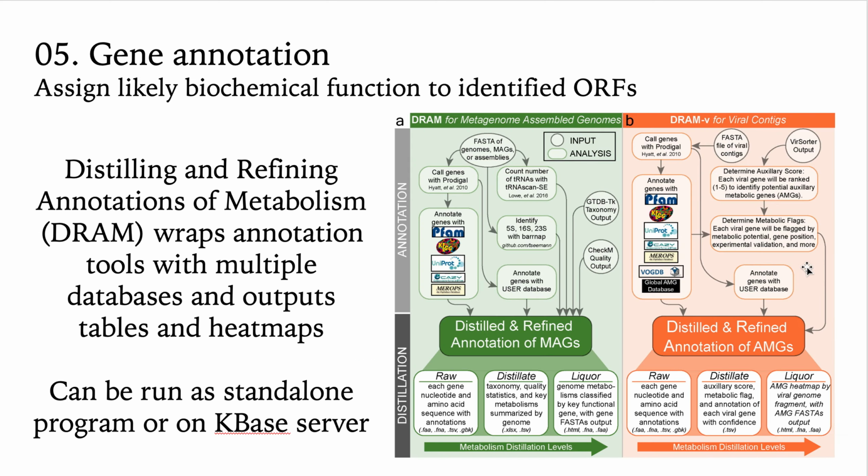DRAM stands for Distilling and Refining Annotations of Metabolism, and this is another wrapper that will use multiple databases and output your results in some very nice tables and heat maps, as well as give you the raw spreadsheets so you can do your own visualizations or analyses if you want. DRAM can be installed as a standalone program, or you can run it on the K-base server.